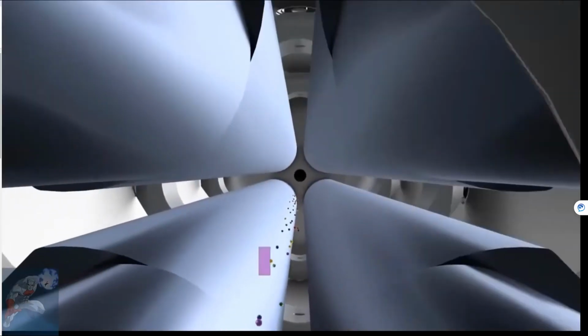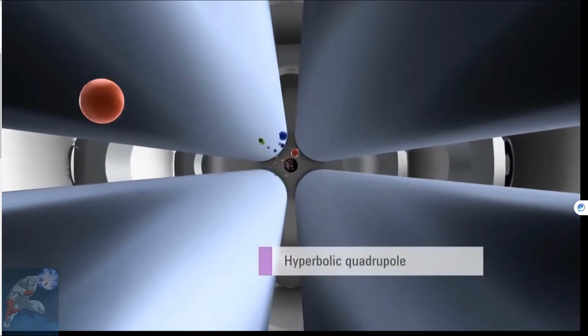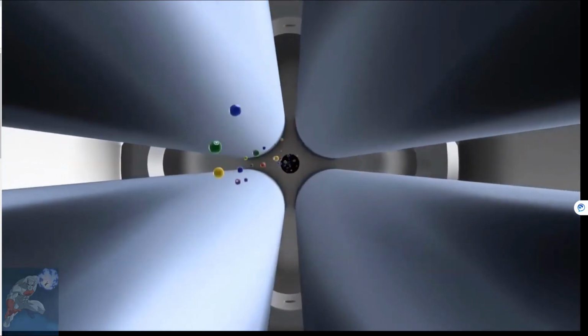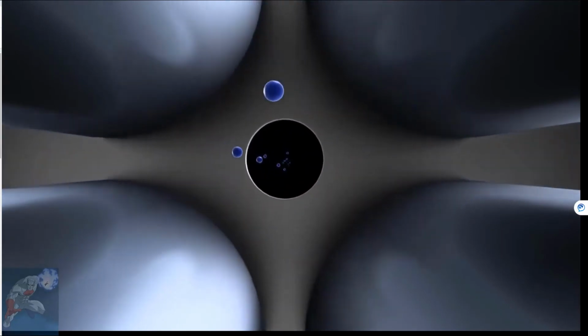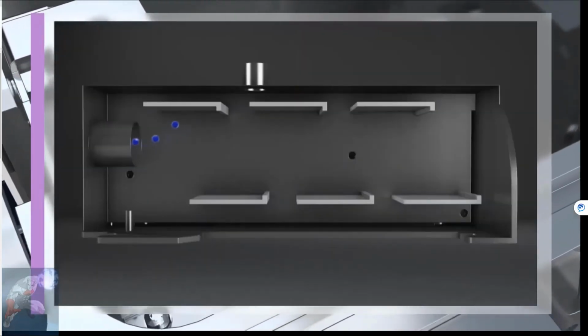Exiting the cell, the ion stream enters the quadrupole or mass filter. The quad has a voltage and RF tuned such that at a particular time during data acquisition, only a single ion mass can successfully pass through the mass filter to the detector.